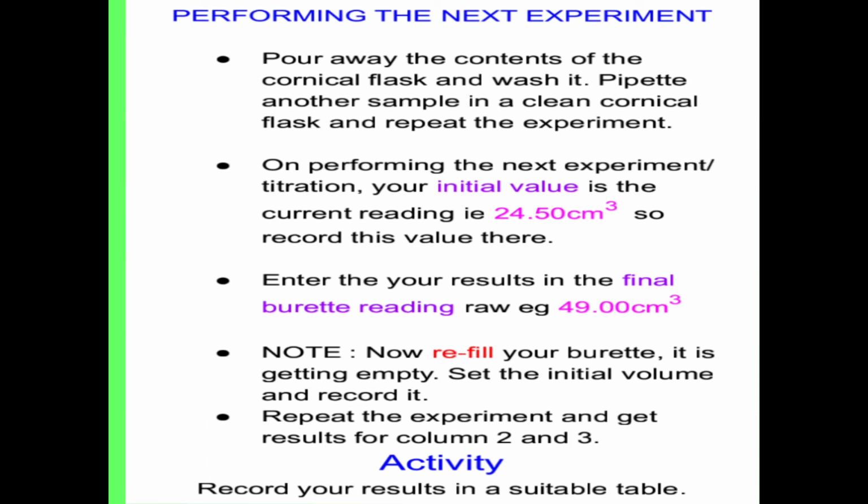By doing as above, we shall repeat the experiments and perform experiment 2 and even experiment 3. And after completing that, the practical is done. So now we are going to do this activity. We are going to record these values we have used as examples.